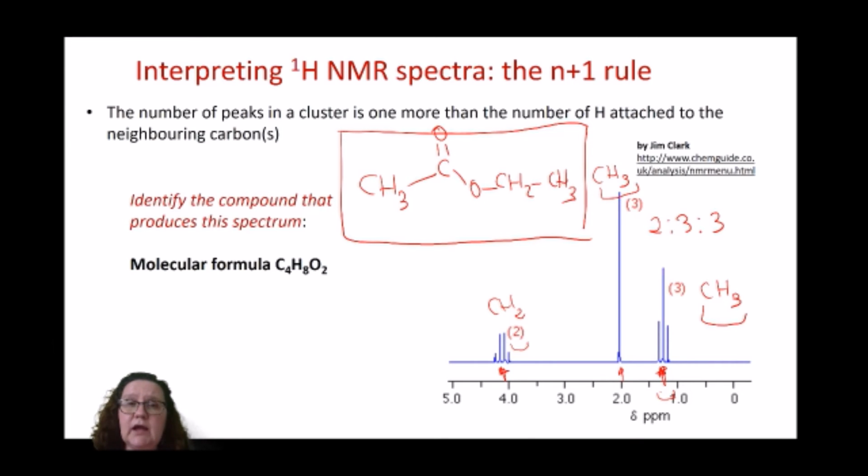And if you look at the previous slide in which there were some chemical shifts for proton NMR, it suggested that hydrogens in a carbon that is also attached to an oxygen would appear, I think, between 2 and 4 ppm. So it seems reasonable that it would be this one, 2 to 4.5 or something like that. So that would be a good candidate for this peak here.